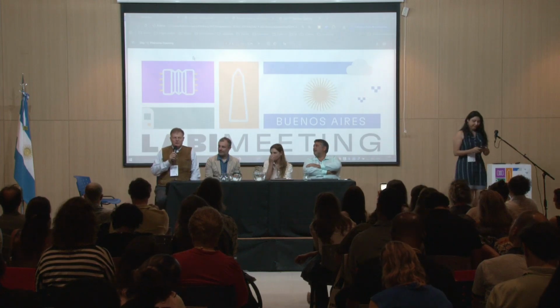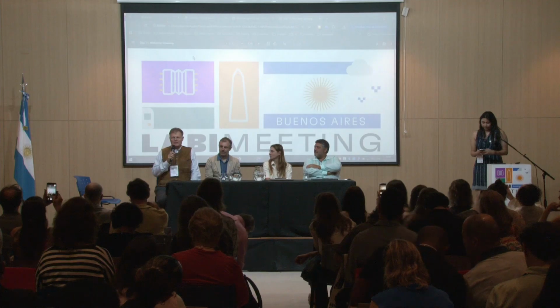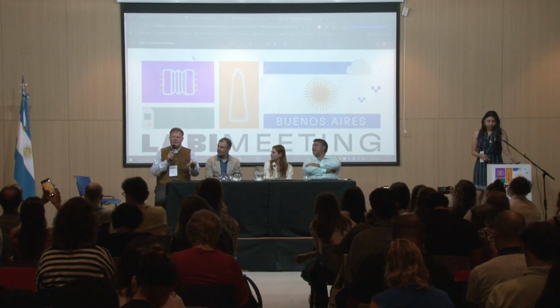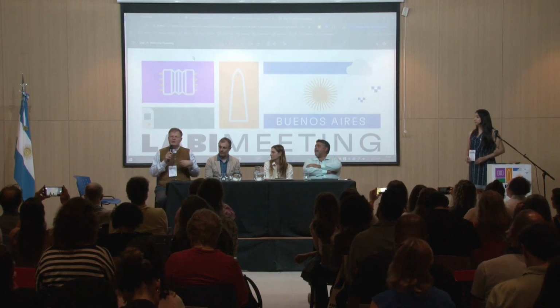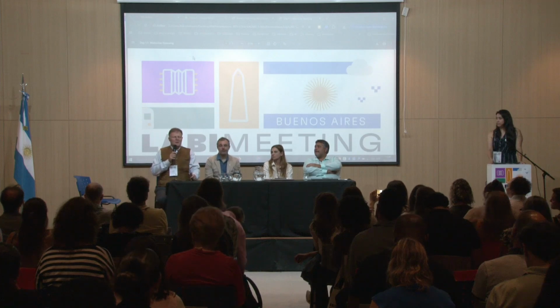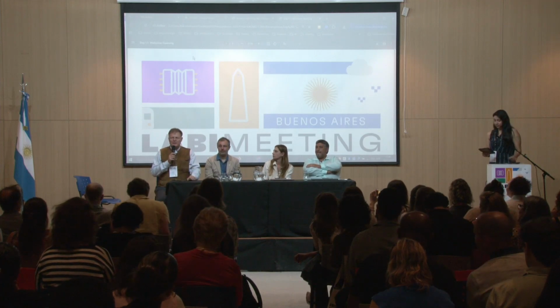Indeed, we do get feedback from clients, and we are about to build a list of antibodies from different vendors where we get confirmation from our users that they work together with our instrument. But this list is in preparation. It's not ready yet.